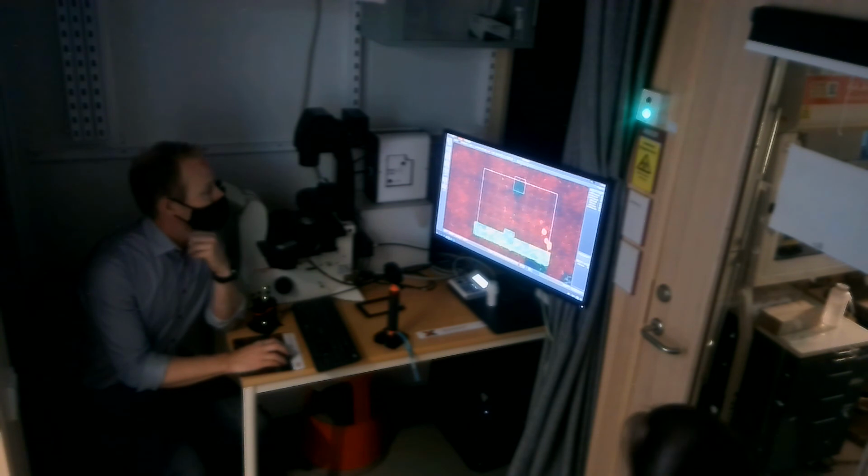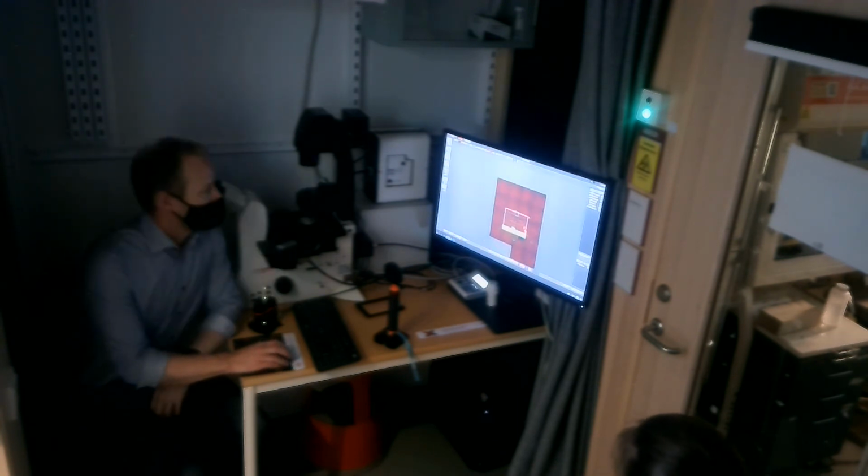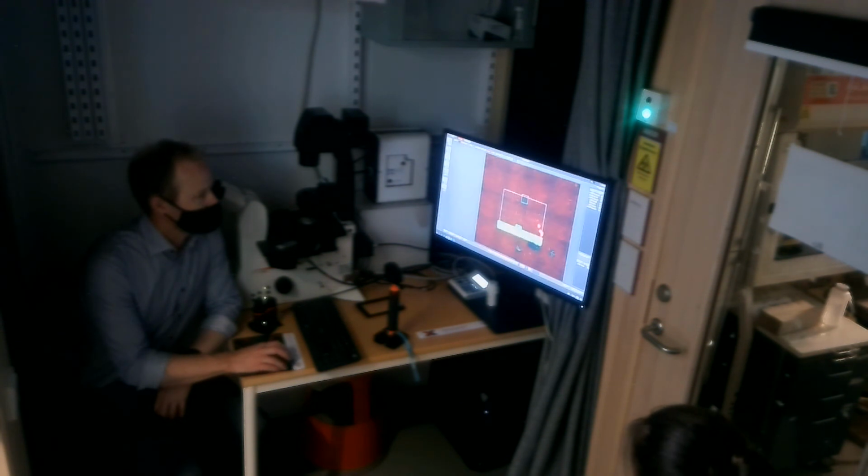Okay, so that is a lot about focus and autofocus stuff. Sounds good. When doing all of this, we can of course remove this. I will set this back to green.